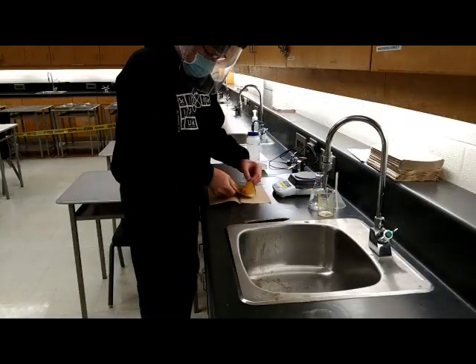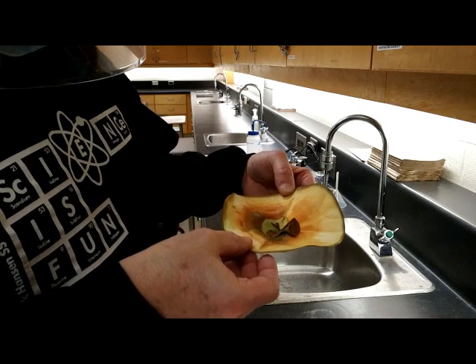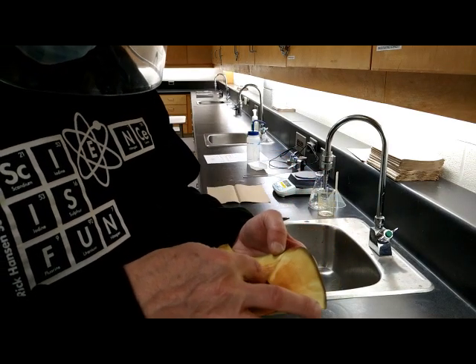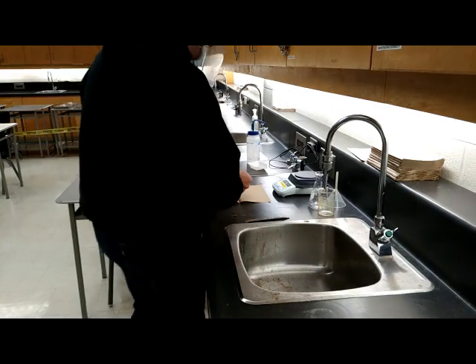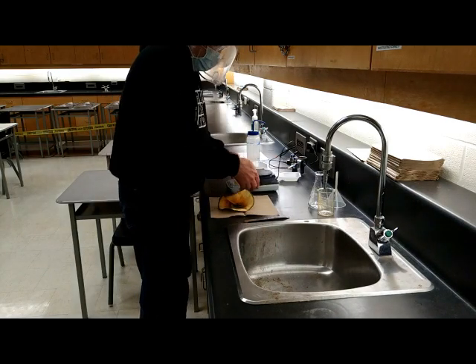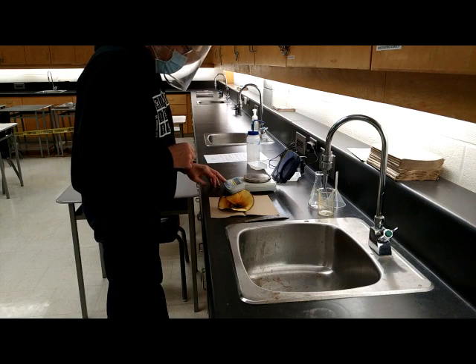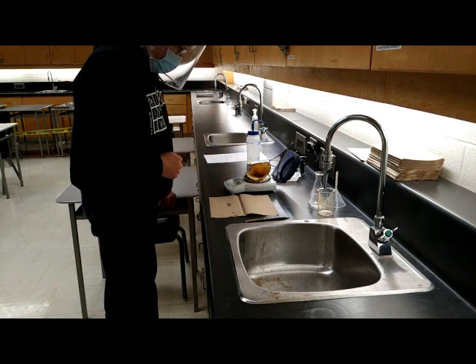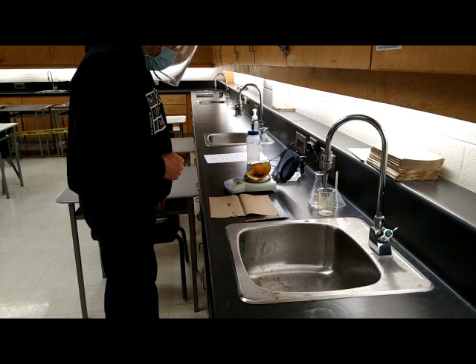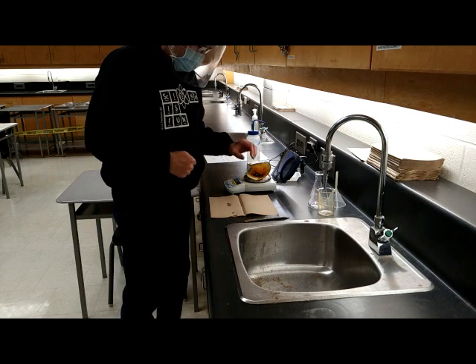And okay, so we've let this all dry out overnight, and we've recovered our material here. Give you a bit of a close-up of this. All right, so there's our copper. Some of it's kind of filled out into a little bit of a cone. And so what we want to do now is we're going to weigh this out. And so again, remembering our mass from the filter paper from yesterday. Okay, so that's zeroed. Set that on there. And we have a total mass of 3.59 grams. Okay, 3.59 grams.